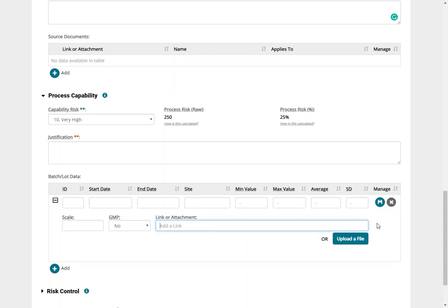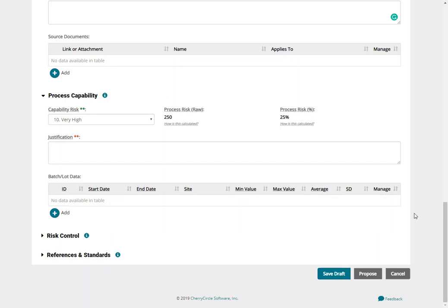We allow you, for example, to upload data across multiple FQAs and to upload multiple measurements. We track and store the originally uploaded files for traceability and data integrity. Other videos will further demonstrate the import functionality. The combination of acceptance criteria and manufacturing data allows for the assessment of capability risk, and additional justifications can be provided. QBD Vision has the ability to calculate process capability metrics and control charts for any requirement, and this can be used for quantitative justification of the capability risk. This functionality is described in a separate video.